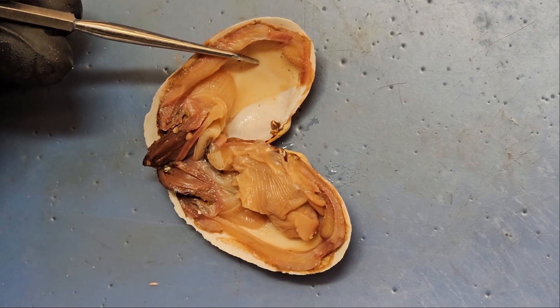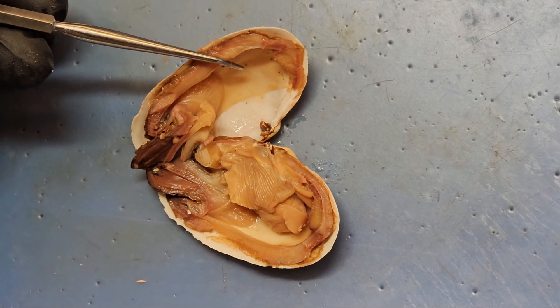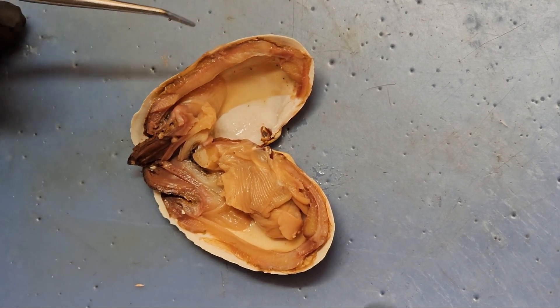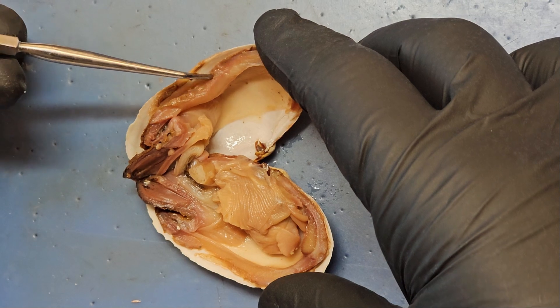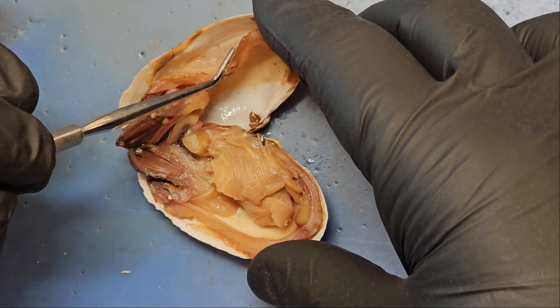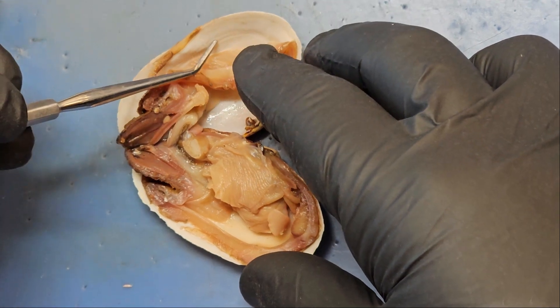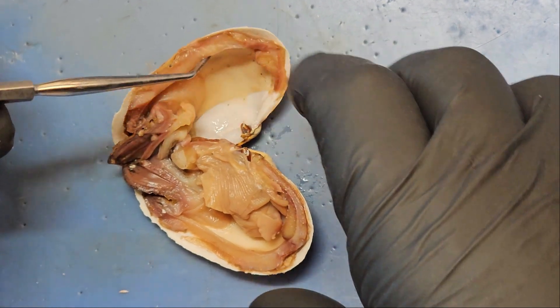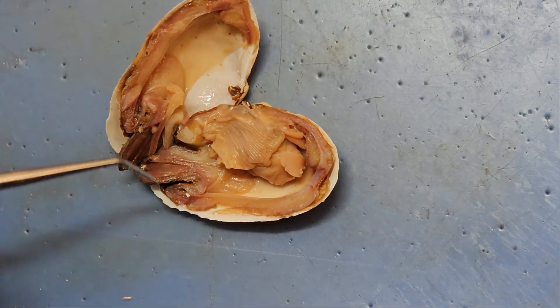The space here is the mantle cavity. On the outside we have a pallial muscle, and if we remove the pallial muscle just a little bit here, we can see the connection of the pallial muscle to the shell. That connection point right here is the pallial line. Now coming over to the rest of the dissection proper.